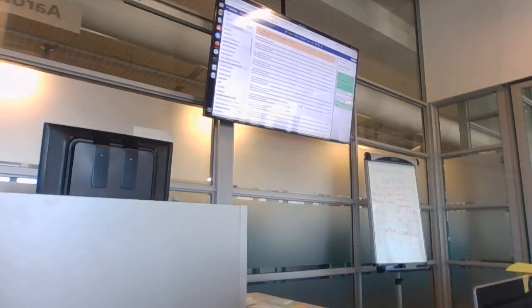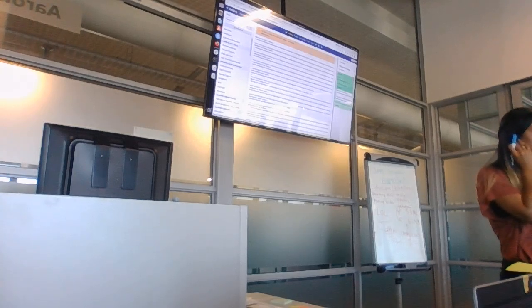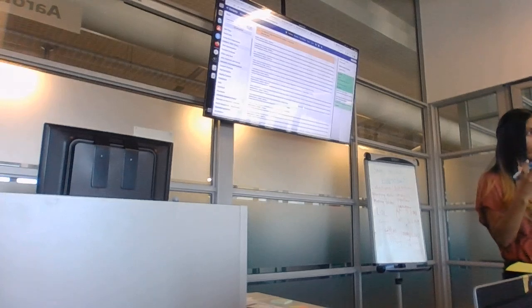The variation if you load a 7 megabytes file and when you load a 9 megabytes file. Probably it's one organism, as you are saying. But that database will probably not have just one of the species in there. In the same way that we make a reference file from multiple different clinical strains, like an ancestral reference strain.